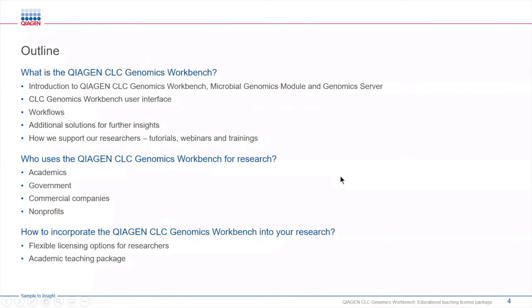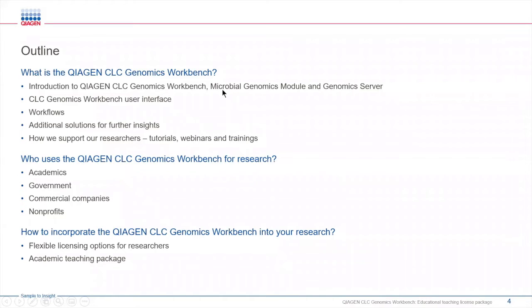Today we're going to go through a high-level overview of the QIAGEN CLC Genomic Workbench, giving you an introduction to CLC, the microbial genomics module, and the genomics server, which is our enterprise solution.